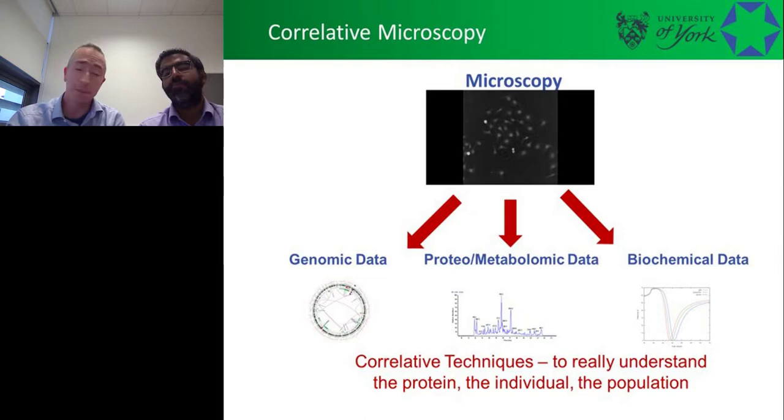Easily 30 colors. So we can now look at 30 different proteins or 30 different transcription factors at the same time, potentially up to 1,000 different markers on the tissue at the same time in one sweep. So what we can now hopefully do is move all of these microscopy techniques that you're going to be hearing about. It's not just us.